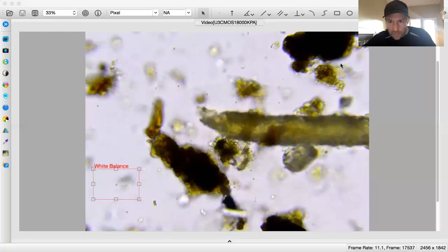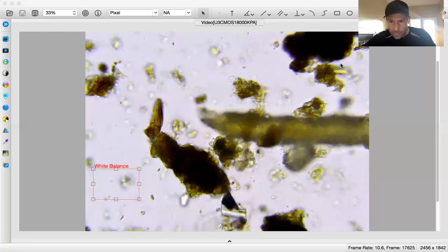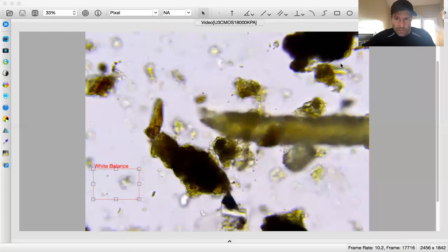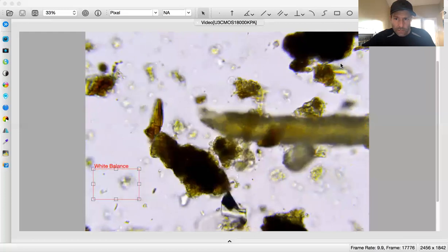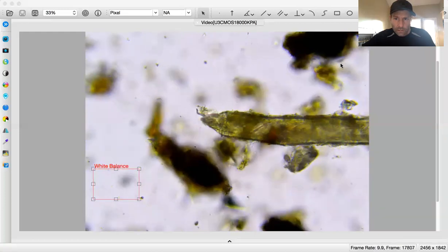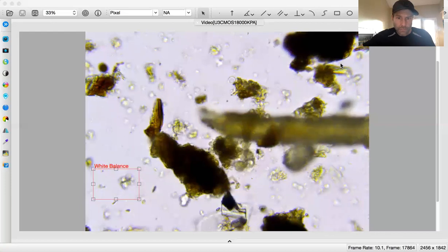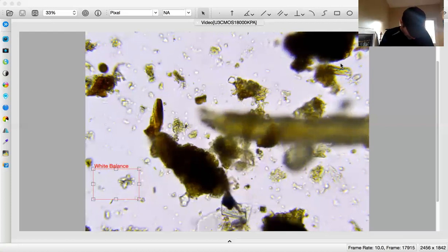He's quick, man. Keeps going in and out of that organic matter, eating up my time. I only got 30 minutes here. Nobody told the flagellates. So anyway, we're moving on because he seems to be busy. But I think I am going to record him as a flagellate based on the size he was and the motility. I believe that was motion indicative of an organism that has a flagellum. So let me go ahead and record that real quick. Flagellate is 1.